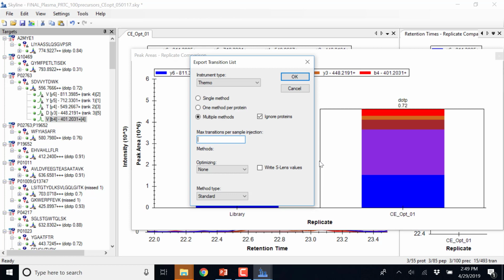If you're not going to schedule, and you know your chromatographic peak width, let's say your peaks are 15 seconds wide, I like to see 1 point per second. And so depending on how fast your instrument can scan, I usually set it up to do one whole cycle a second. So for 15-second wide peaks, I'll have 15 points, which I'm very comfortable with, especially in the early phases. So let's do 750. Let's assume I've got 1 millisecond dwell, 1 millisecond interscan delay, so that's 750 transitions per second.